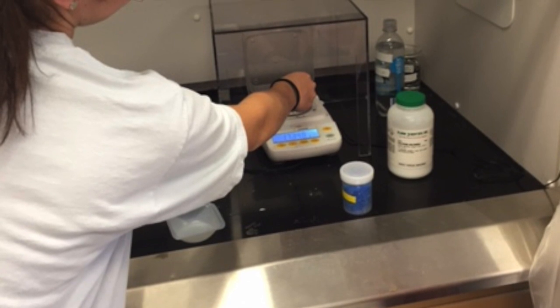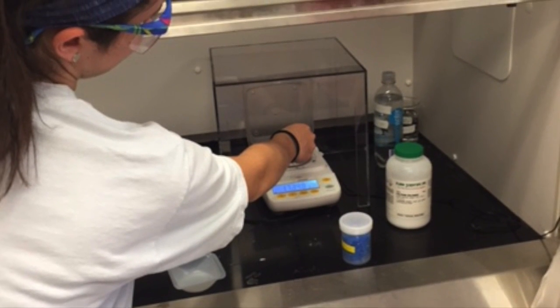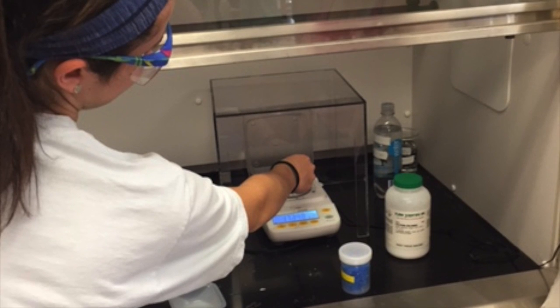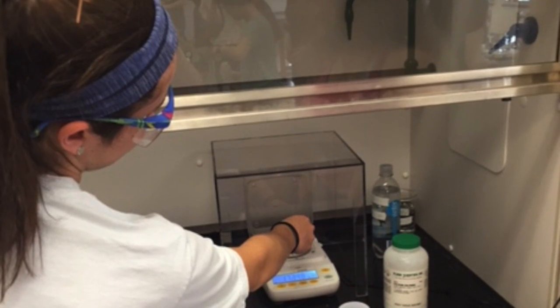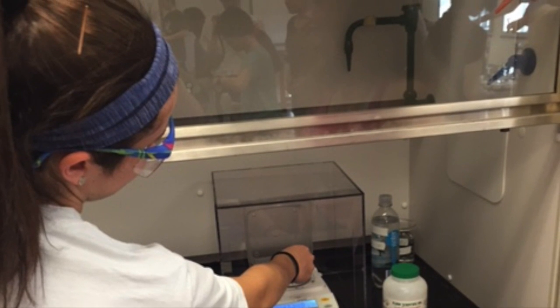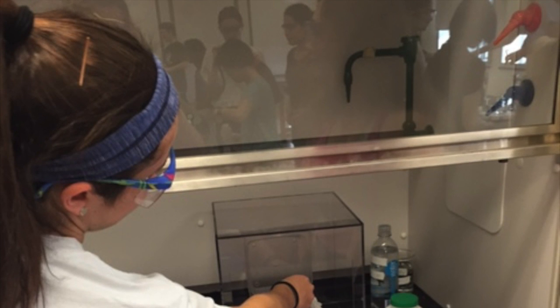First, you can see that using a balance and weigh boat, we are measuring out some of the chemical. The chemical we used for this solution is actually more of a pellet, so it needed to be ground in order to make a solution first.